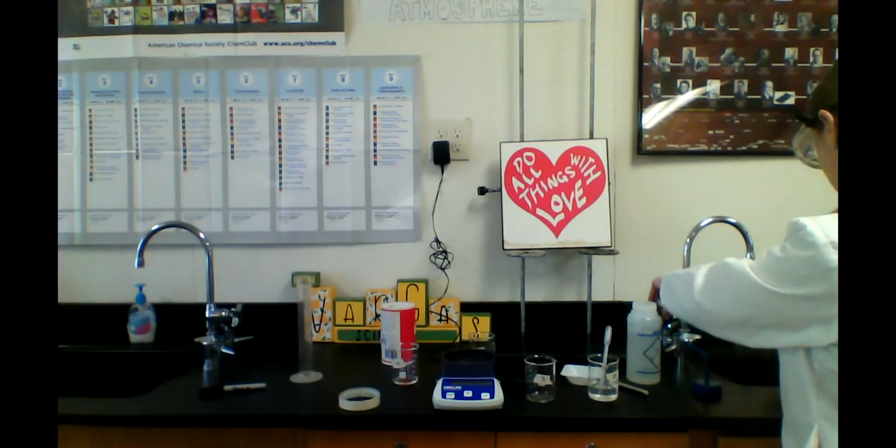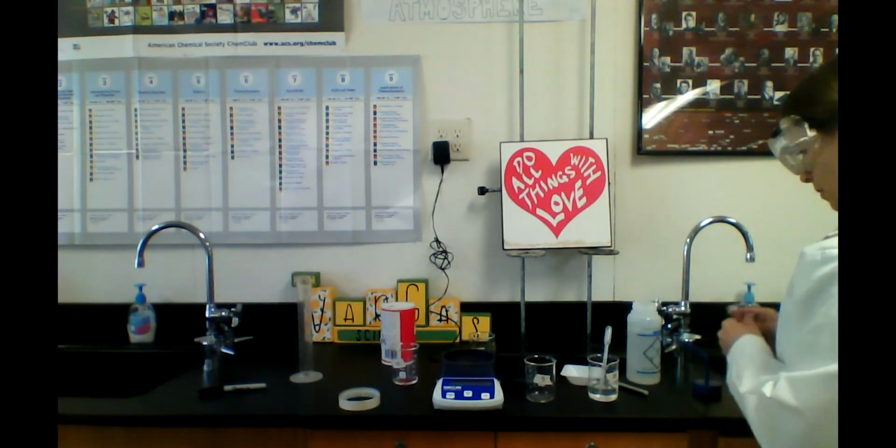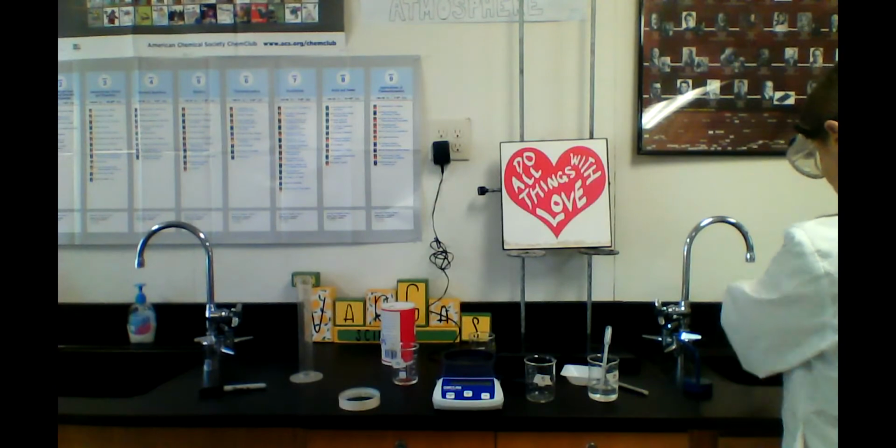So my 4 milliliters of stock solution go into my beaker. All right, and now I'm going to rinse this with some tap water. I'm going to rinse it with some distilled water, so there's no salt in my 10 ml graduated cylinder. And I'm going to go ahead and go back and add the water.